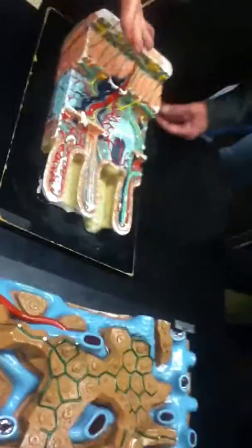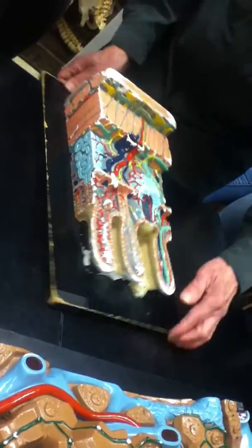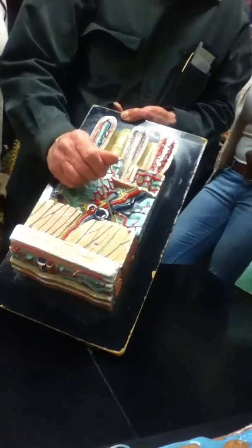Okay. Here you can see longitudinal fibers, and here you can see circular fibers. No, I'm sorry, the other way around. Here you see circular fibers, and here longitudinal. Now, the yellow elements that you see. You see some thin yellow elements here, and over here you see these very thick ones. Let me raise this. See the thick ones and the thin ones.